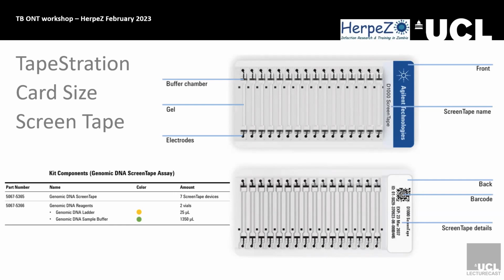Now they've changed the chemistry group. In terms of your input, it's now pretty much the same level as often, because if this is your fragment and it's so small, when you do the cut and tag it cuts it, and it's less than 500 base pairs. It means that when you do 150, they sequence into each other. Yes, exactly. So they need to be a big enough fragment, and as it is cutting, it's giving uniform fragments to give you more paired reads.